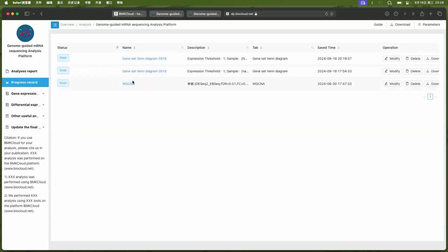Here you can see my WGCNA analysis submitted earlier, and here it is finished. If you just submit an analysis, this tag will be running. So let's go back to my slide, and I will introduce the result of WGCNA.